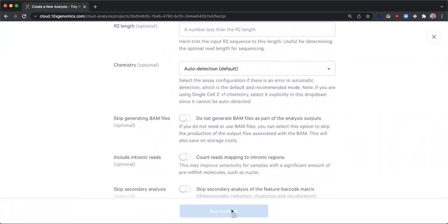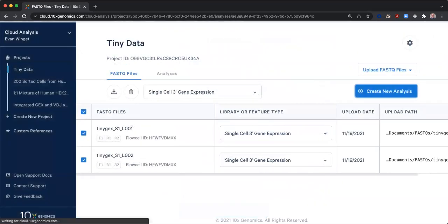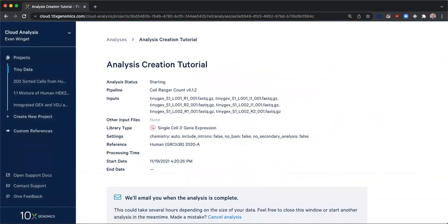When I click Run Analysis, my pipeline instance is immediately created and computation begins. When the analysis completes, you will receive an email notification and can open the analysis page to access all output files.